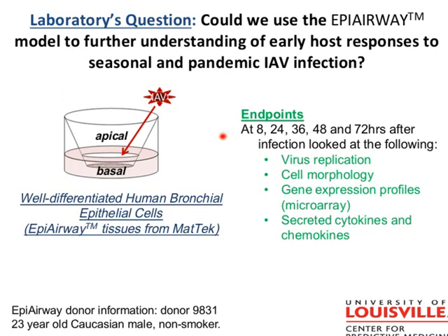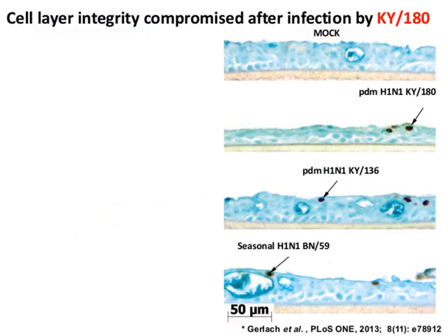We collected cellular supernatant, both apical and basal, and further collected the cells using a reagent to isolate RNA, DNA, and protein, or fix the cells for immunohistochemistry. To evaluate the cells by immunohistochemistry, we made paraffin-embedded blocks of the cells and counterstained with hematoxylin in blue and influenza nucleoprotein seen in brown. These representative sections are shown for each virus and an uninfected mock control.